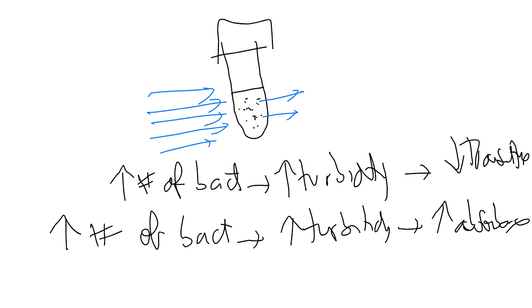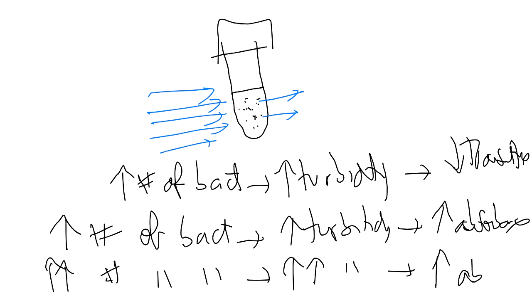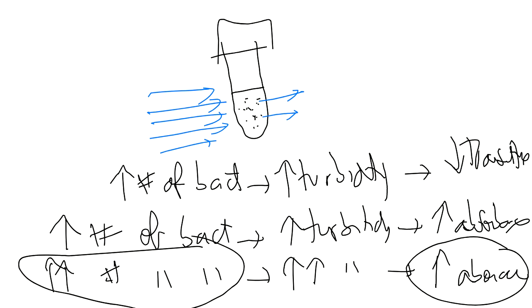As you have more and more bacteria, more and more turbidity, the numbers for the absorbance go up. Mentally speaking, it is easier for our brains to retain more bacteria, more absorbance. If you work with transmittance, more bacteria, less transmittance.